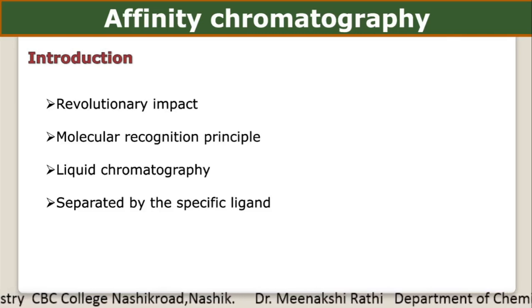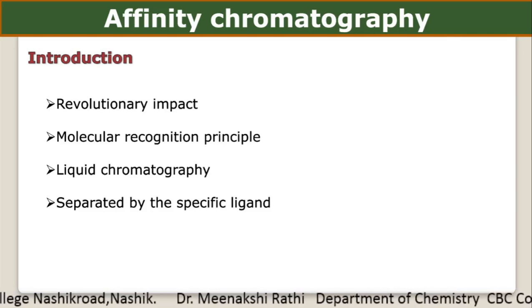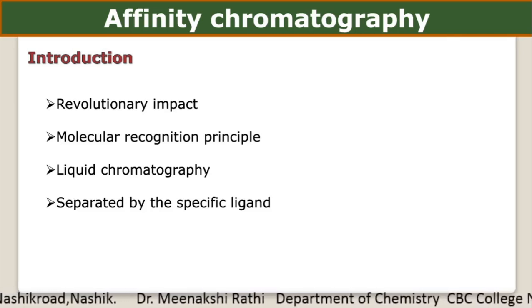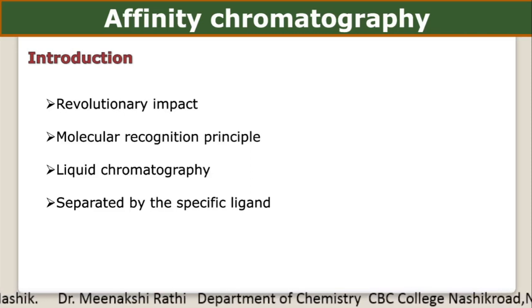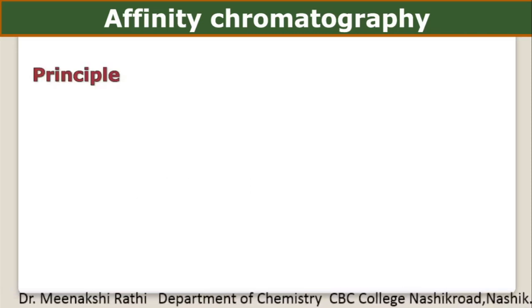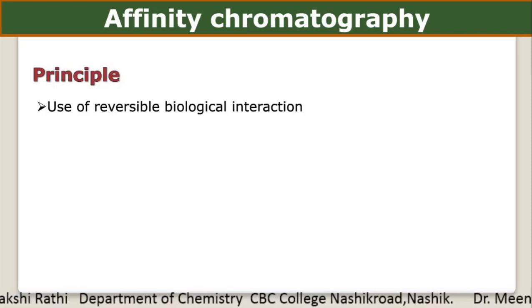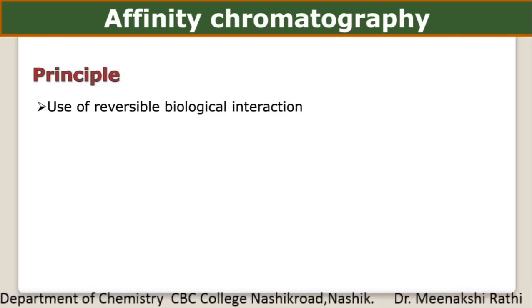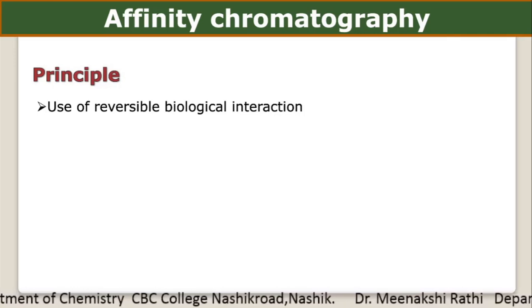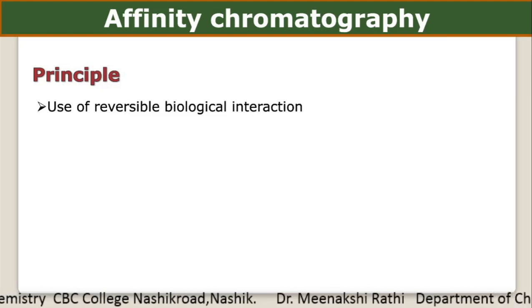By using this technique, or in affinity chromatography, molecules are separated by specific ligands. In this technique, there is a use of reversible biological interaction. What do you mean by reversible biological interaction? That you will understand when we see the methodology of affinity chromatography.